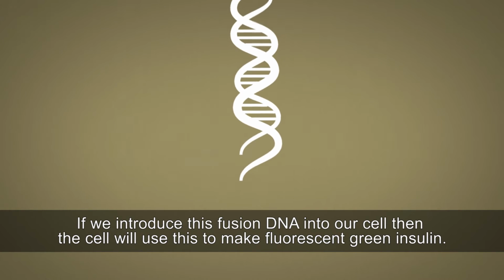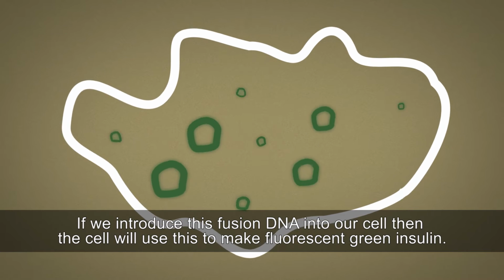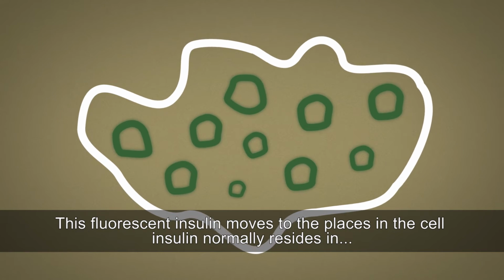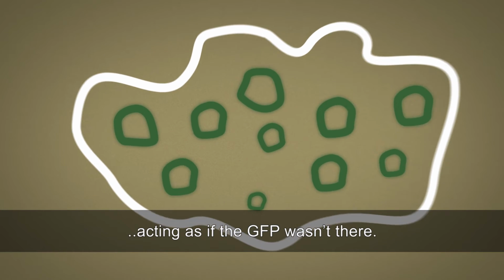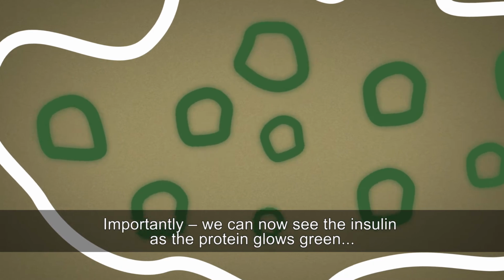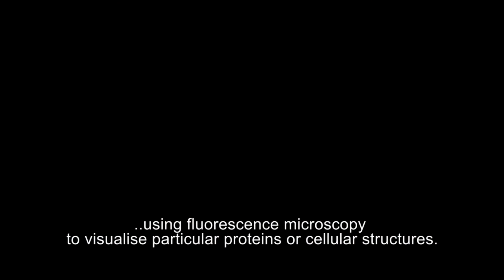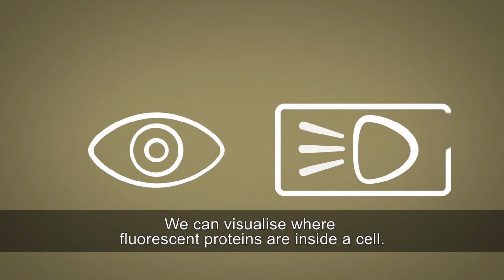If we introduce this fusion DNA into our cell, then the cell will use this to make fluorescent green insulin. This fluorescent insulin moves to the places in the cell insulin normally resides in, acting as if the GFP wasn't there. Importantly, we can now see the insulin as the protein glows green, using fluorescence microscopy to visualize particular proteins or cellular structures. We can visualize where fluorescent proteins are inside a cell.